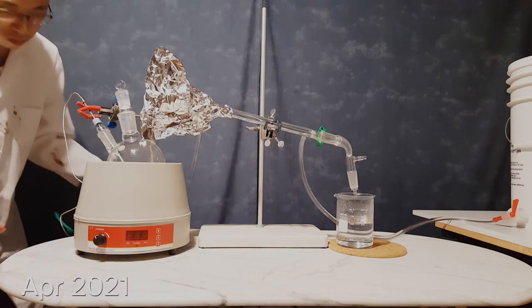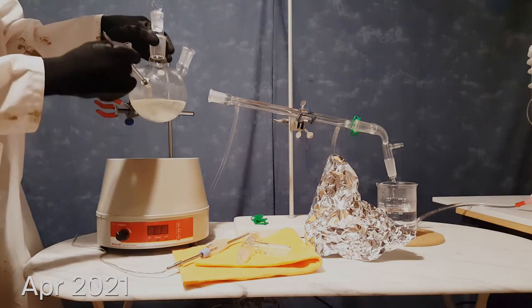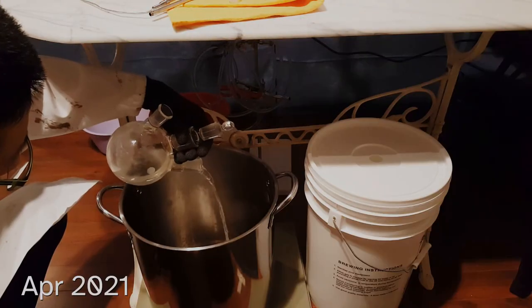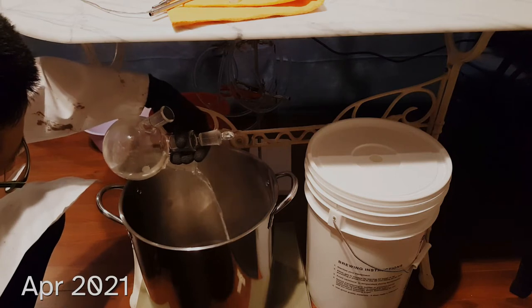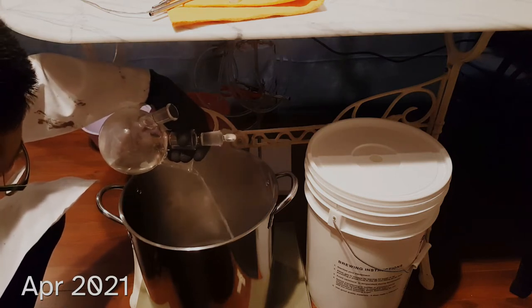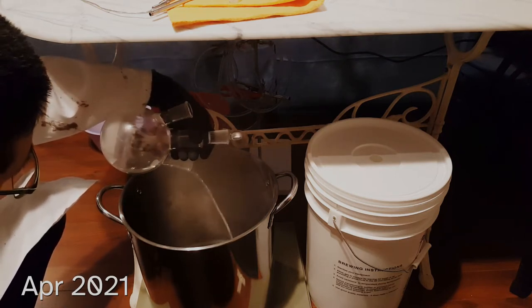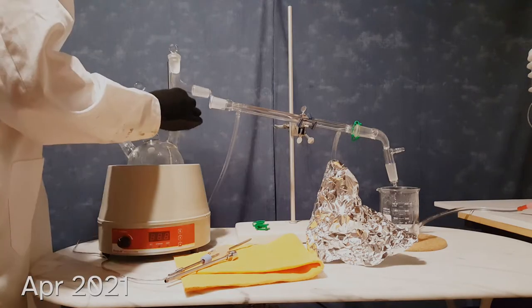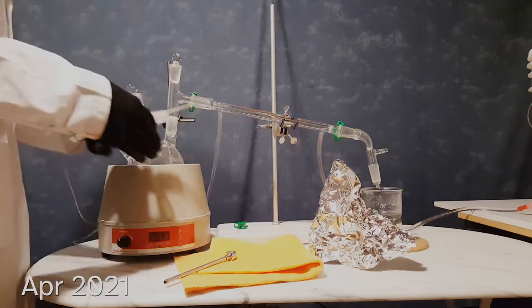After about 40 minutes of heating, I collect about 400 milliliters and I empty out the distillate side in a clean bucket. The boiling flask, or bottom side, contains the salt, and I save it in a separate bucket. I wait for the boiling flask to cool down so I don't thermally shatter it, and then I refill it with room temperature spring water for another cycle.